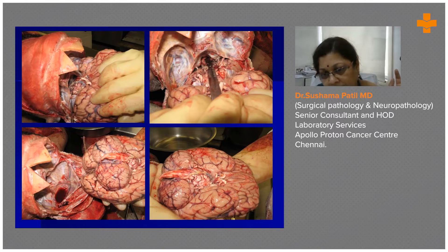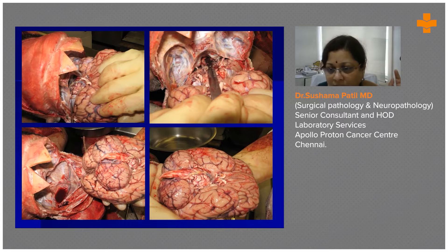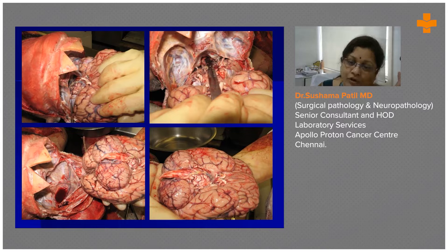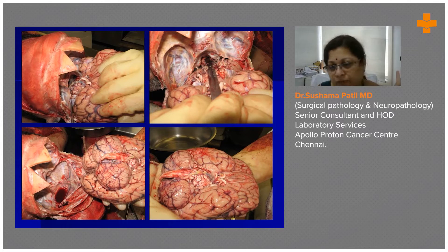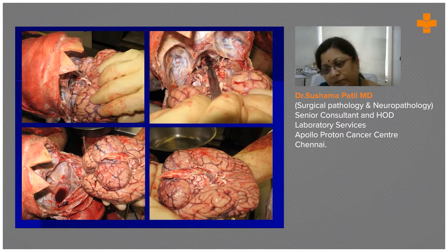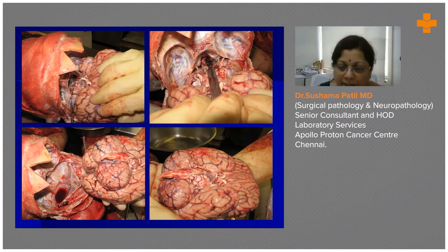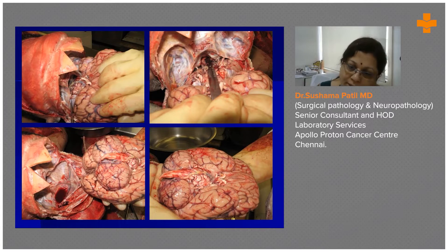The optic nerves become the optic tract. Below the basilar artery is the pons. These are the two temporal lobes. We make a gross impression of the case, weigh it quickly, then fix it for two weeks before the brain can be cut. It is suspended in formalin — a twine thread is placed below the basilar artery and tied to the lateral aspects of the bucket — then after two weeks, we wash the brain and start slicing.